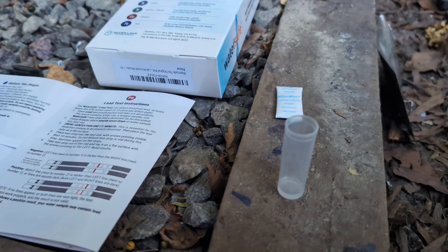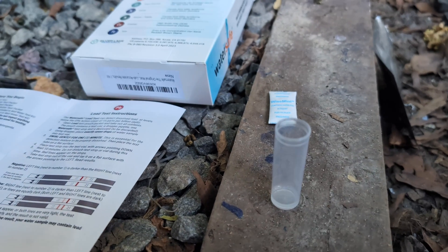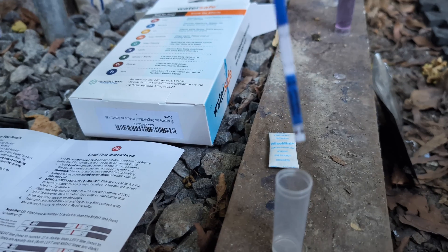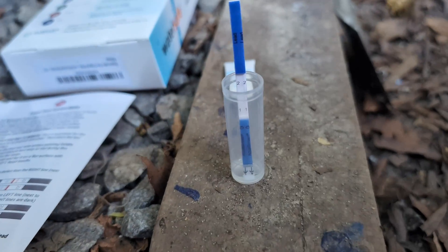This is the lead test. I got exactly seven drops of water and put it in this vial. I put this strip in with the arrows pointing down, and I let it sit there for 10 minutes.